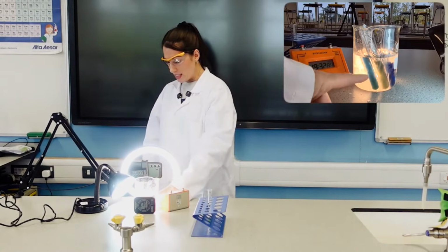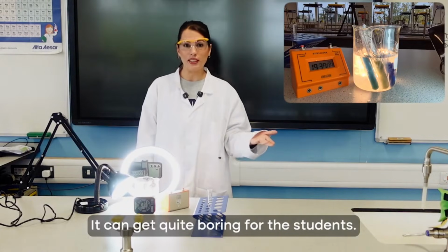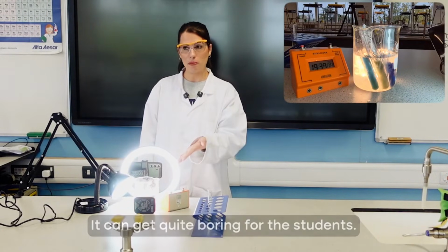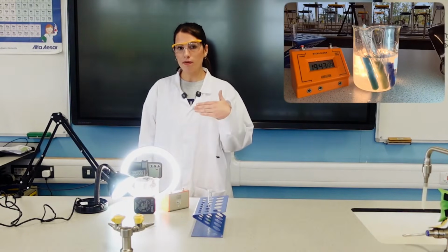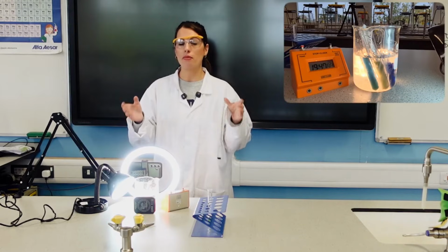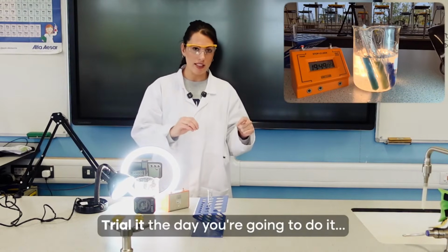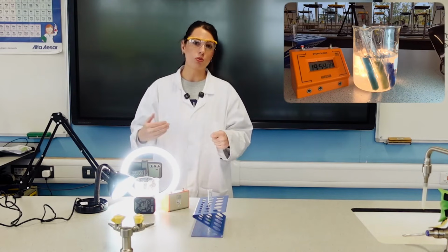And we can see it is still working. The colours are changing. It can just get quite boring for the students if for 20 minutes they're just sat watching this with nothing happening. But if you've got another activity, they could do that. But it'd also be better if it was quicker, so there was time for repeats. So the main thing is, if you have the time, trial it the day you're going to do it, so you know what volumes work best for the spinach sample you have.